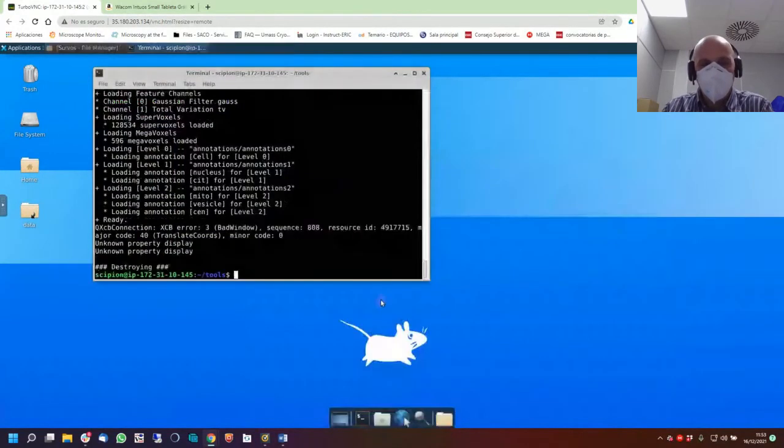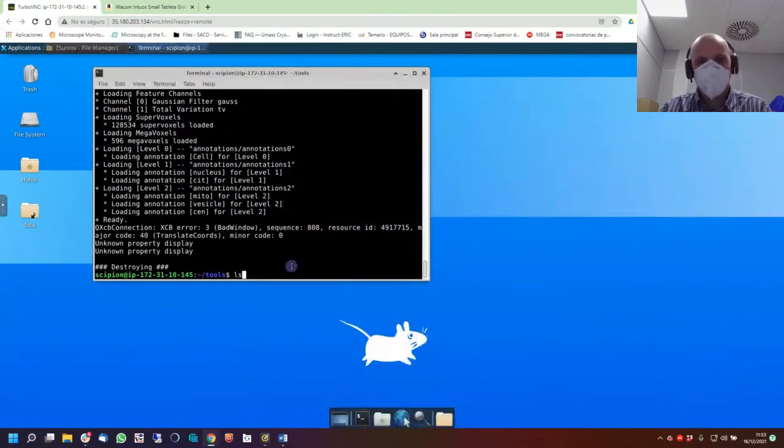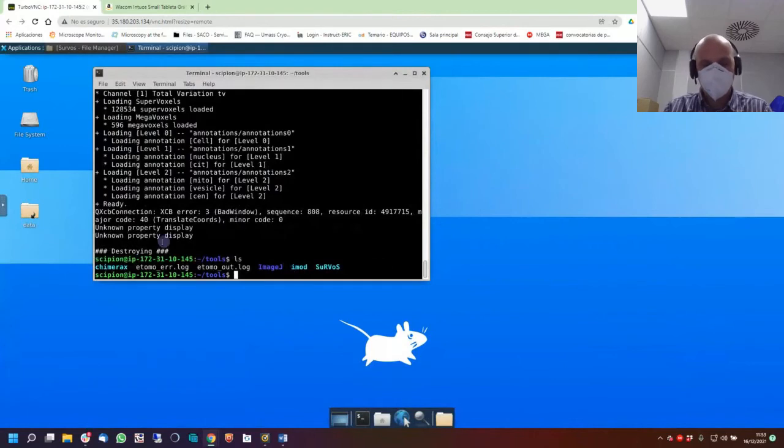So now we are here in tools, ls, and then we have ChimeraX. So let's try to run ChimeraX.